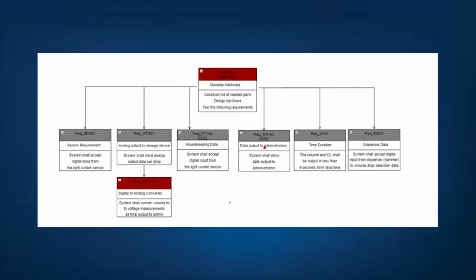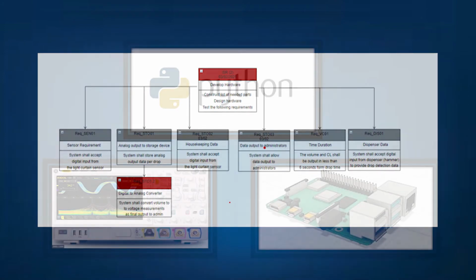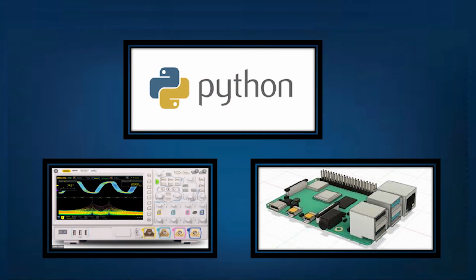Additionally, we verified the input and output constraints, as well as the logging and storage requirements using this setup. The input and output was verified in the lab using an oscilloscope connected to the GPIO board. The output time was verified in code using the Python time libraries.